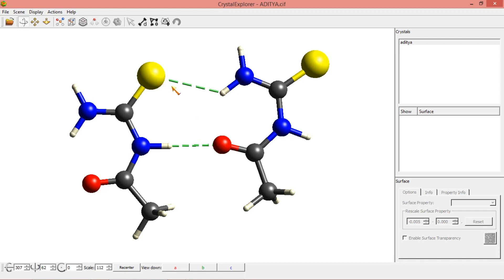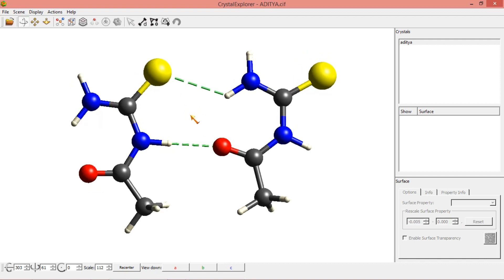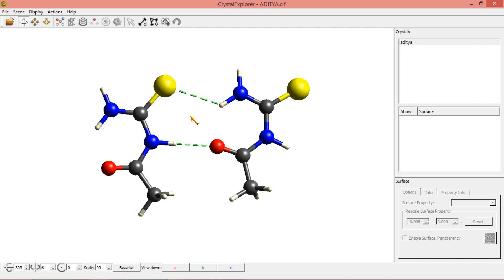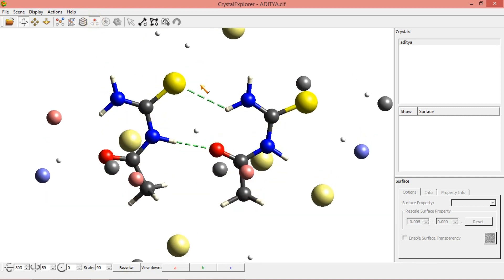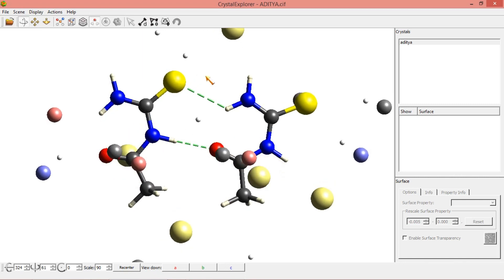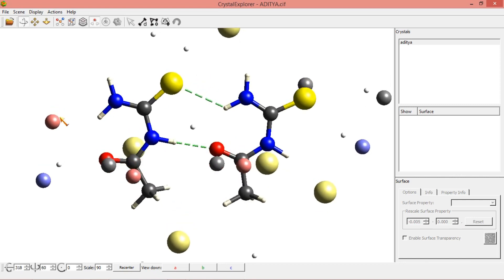These are the intramolecular hydrogen bonds. If you consider this is a single molecule, within the molecule you can form the interactions. Now I am going to show you intermolecular interactions. To get that, just click on to these options.